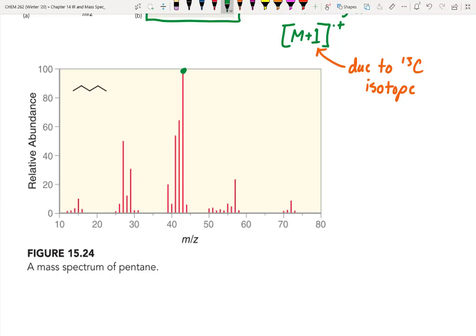Is that always going to be our parent peak, though? No. It's the tallest one on the furthest to the right, right? So I would say this is the rightmost cluster, right? Okay, so now we need to identify the parent peak within that cluster. It's going to be the tallest peak, right? So this must be the parent peak right here. So I'm going to make a note that over here, this is going to be our parent peak.